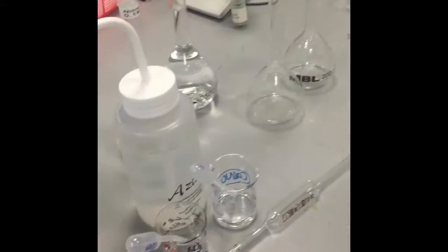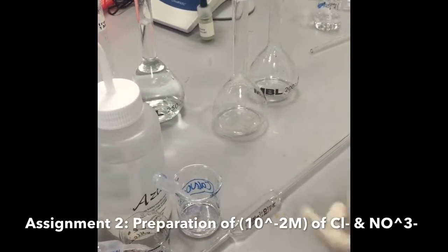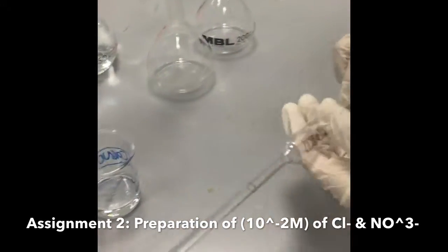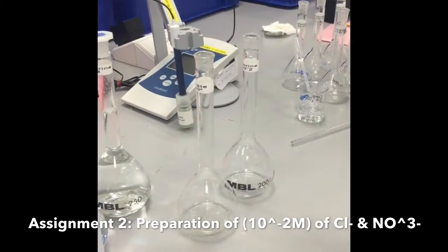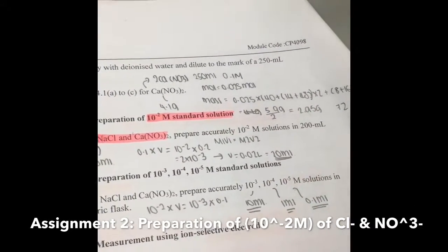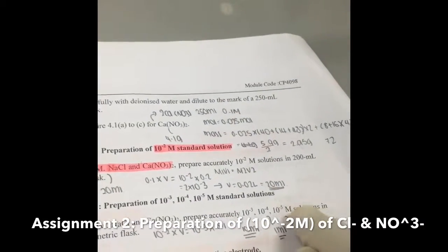So, assignment 2: preparation of 10 to the negative 2 molarity of the solution. Basically we need a 20 ml pipette, because we're going to pipette the nitrate solution to here. Why is it 20 ml? Because of the formula M1V1 equals M2V2, and as you can see here, it derives to 20 ml. Okay.